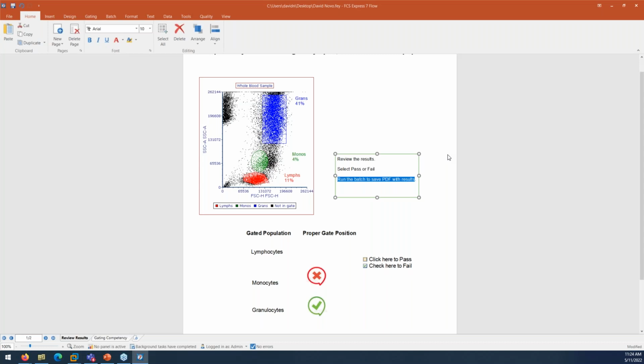And as you may have assumed, we actually just reused some of the same layout. The competency and the training layout are basically the same, just we hid a lot of the hints and everything like that in the competency version of the layout so that, of course, the person doesn't see them when they're doing the competency assessment. Okay? So again, there's a lot of stuff in here.